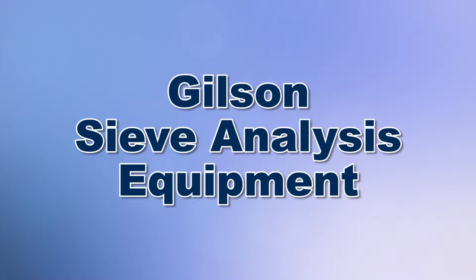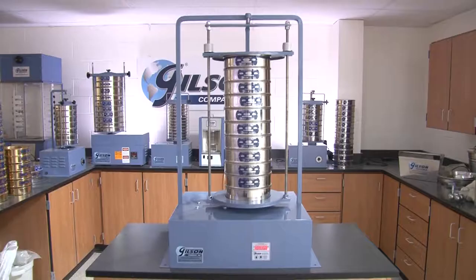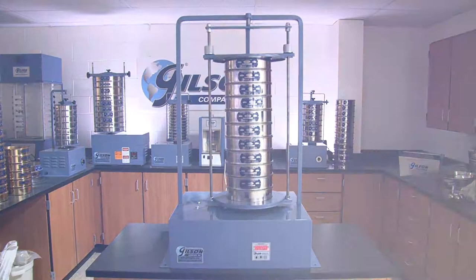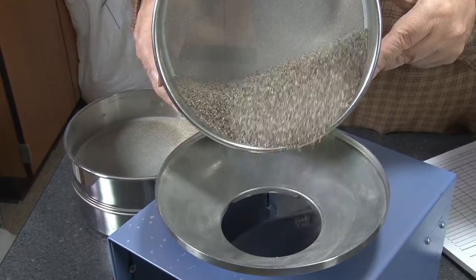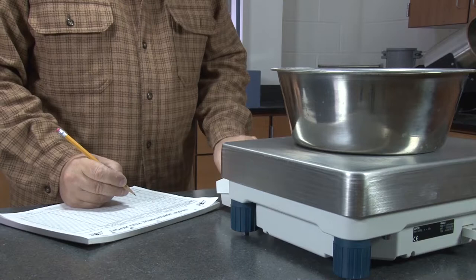When you need to accurately perform particle sizing operations, Gilson is your best choice. Gilson has everything you need to perform any sieving test, ensuring that your particle sizing analysis is compliant with ASTM and AASHTO standards.